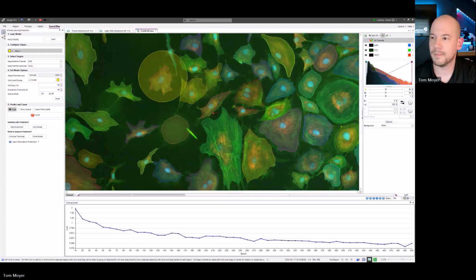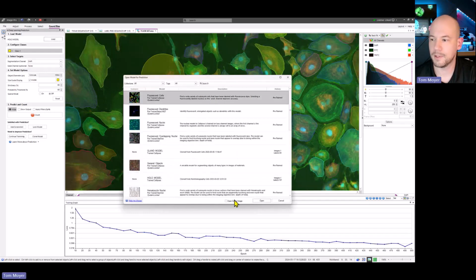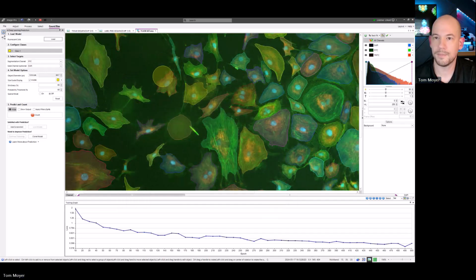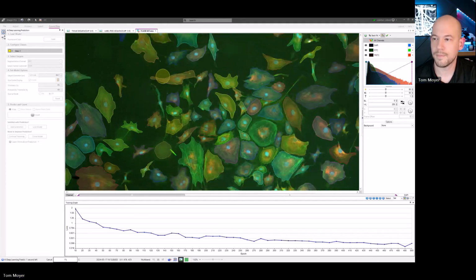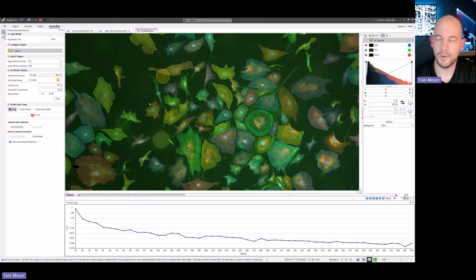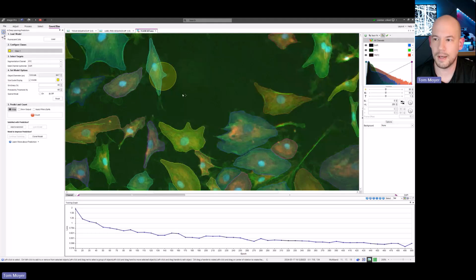Lastly, let's go ahead and clone our fluorescent cells model, add some additional labels. So fluorescent cells, my segmentation channel is FITC, seed channel is DAPI. One thing to mention too, this fluorescence image here, you can see we have a lot of noise in the background.